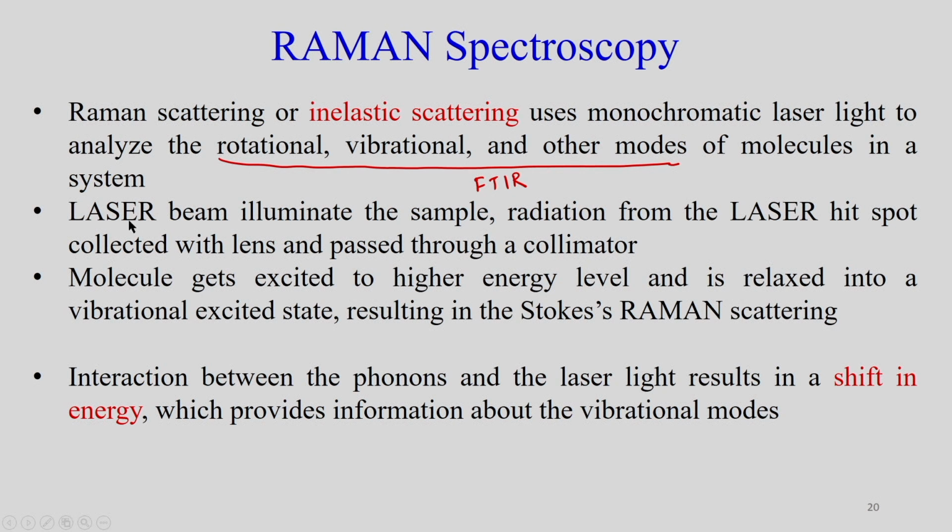Here, as we are using the laser, the laser beam illuminates the sample, and the radiation from the laser hit spot is collected by the lens, and then it is narrowed down through a collimator.